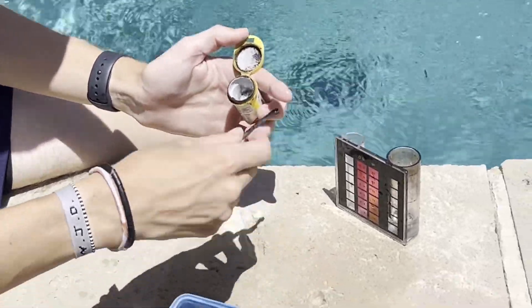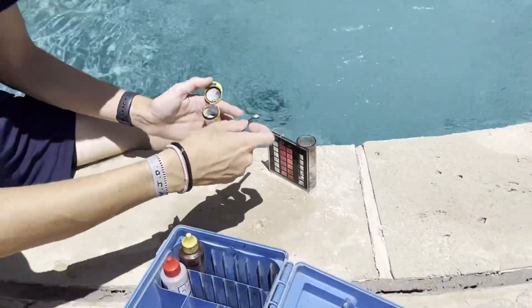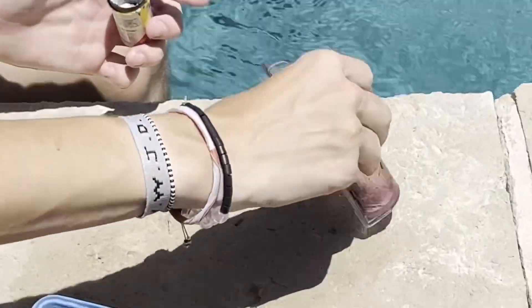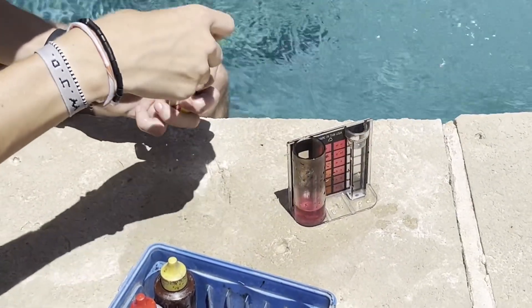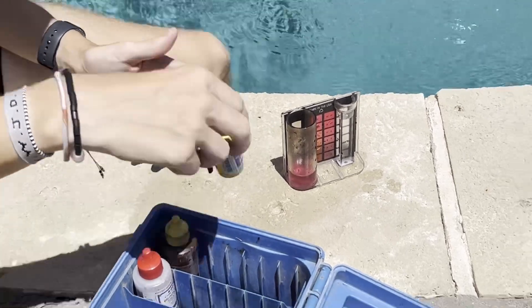You take this powder, get one scoop, and put it in the large test tube filled to the number 10. If it turns red, you've got chlorine. Now here's the cool part — we're going to find out how much.